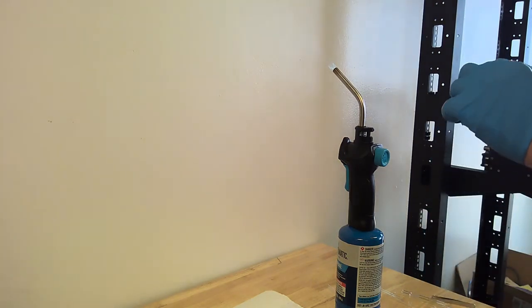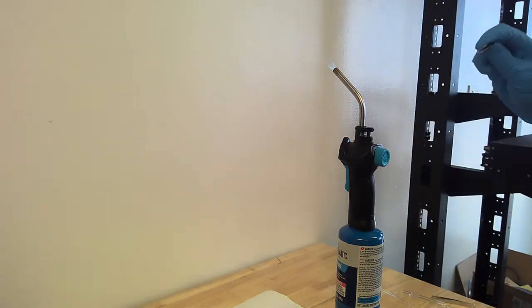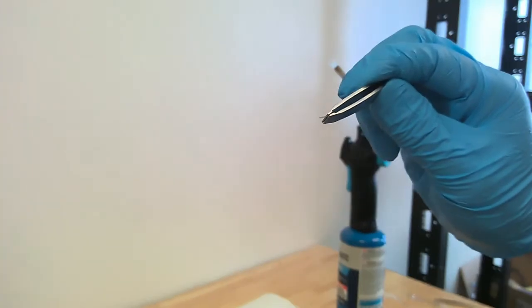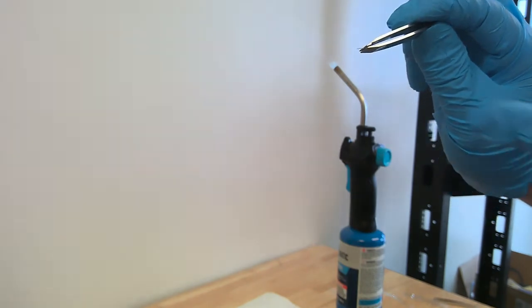So we've broken off a very, very tiny piece of glassware, but it has some weight and some length to it. Now we're going to taper off and seal one of the ends using our flame.